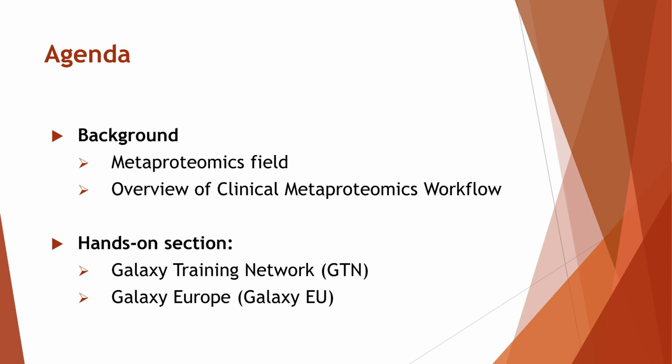The agenda for this video includes some background on the metaproteomics field, such as why we developed this workflow, and an overview of the clinical metaproteomics workflow. This will lead us into the hands-on section, which will introduce the GTN website, where we host the tutorials, and the Galaxy EU website, where we will run our analysis.